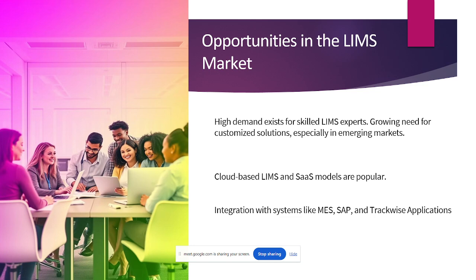LabWare is a SaaS model. Cloud-based LIMS will also be there. Some LIMS are cloud-based, on platforms like Azure or AWS. AWS, Azure and Google Cloud, those are the cloud-based ones. So the SaaS model is very popular. Why? Because the SaaS model gives more compliance and also more configuration. High configurability will be there.